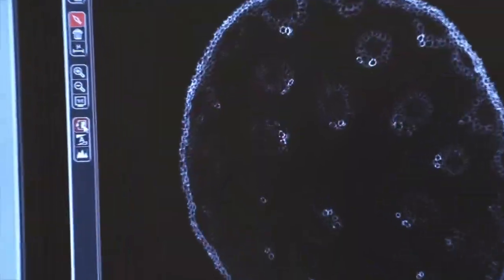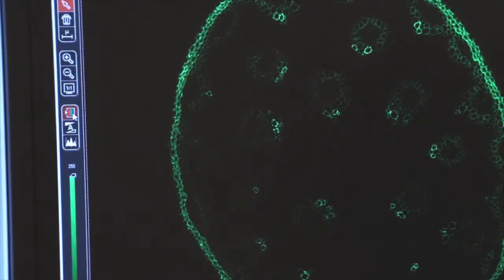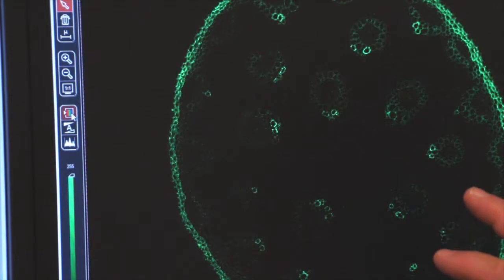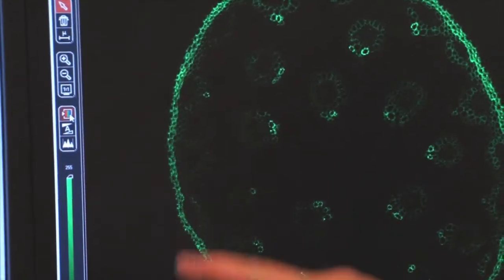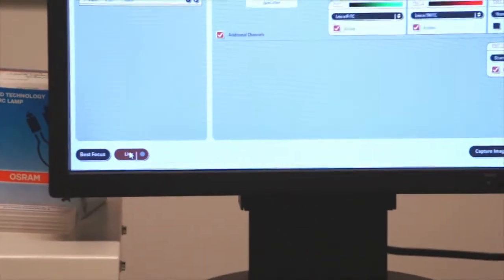If I click on the lookup table again, it goes to a monochromatic image. If I click on it again, it goes to color. Now I can change the color of the output on my screen. To do that, I'm going to stop the live imaging and then we're going to click on the photo multiplier too. So I'll go to stop, turn off the live imaging.